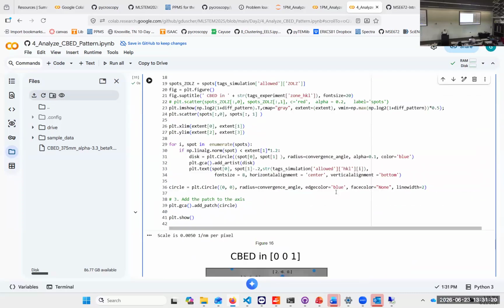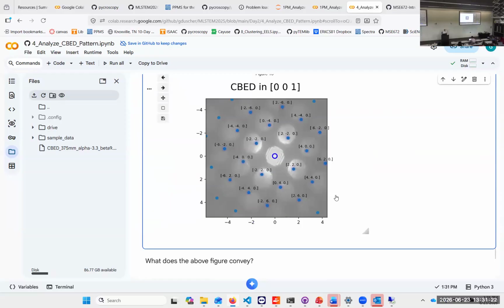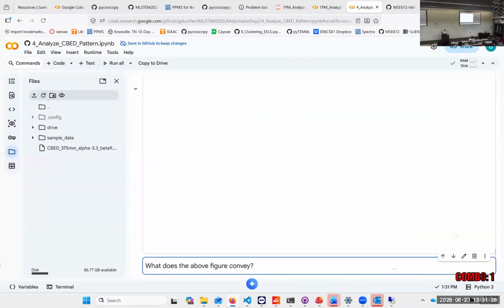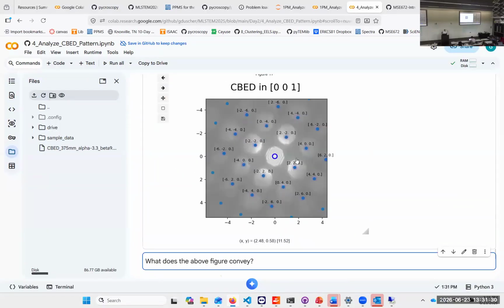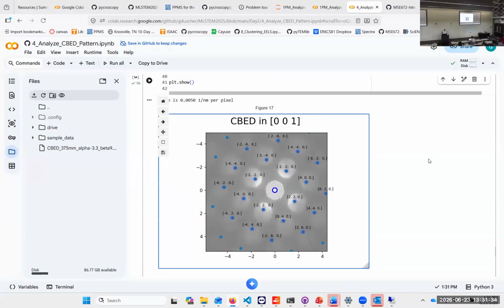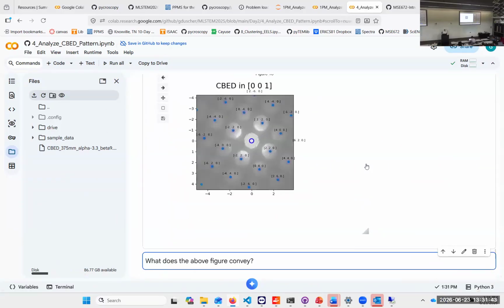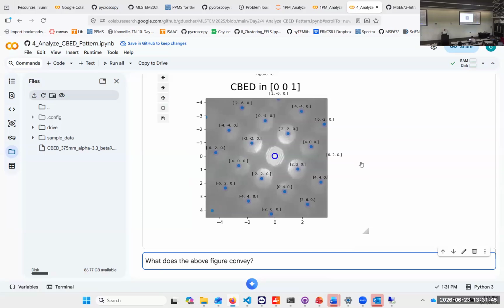Rotation minus 10. Okay, now I don't remember in which direction it rotates, but I think this is counterclockwise. Okay, it's closer to 15. My positioning is still wrong. So it's closer to 45. Okay, that was a lucky guess.